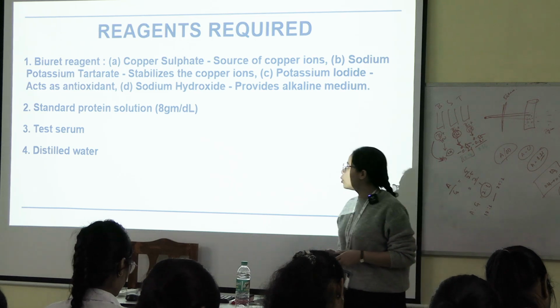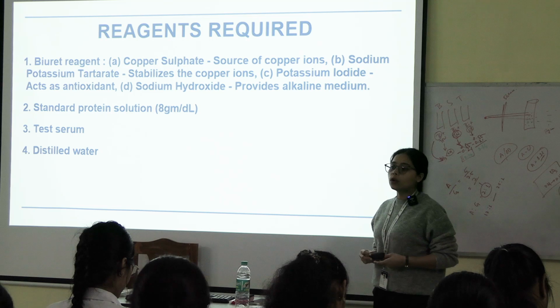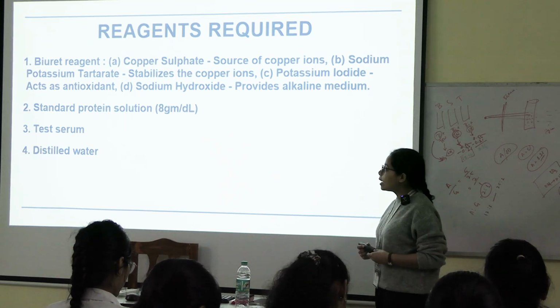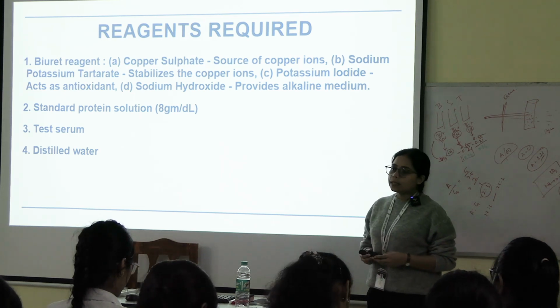Then we need standard protein solution. The kit that we are using, the Coral kit, and during your exam you will get the same kit. The standard protein solution is 8 gram per dl. But in other kits, there are many kits.